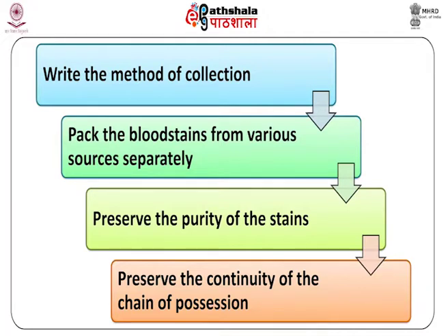Preserve the purity of the stains. This is achieved by preventing mixing of the stains with one another or rubbing the stain with the container or with other parts of the article. Preserve the continuity of the chain of possession and distinct identity of the evidence through proper packing, labeling, sealing and observing the other legal formalities.